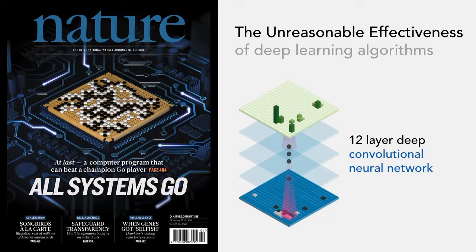In some sense, the reason why they could really beat humans is that instead of using brute force, as was done to beat humans at chess, in this case the whole image of the board is looked at and processed in a way that is very akin to a form of artificial intuition, if you want. So this is a very powerful concept. These deep convolutional neural networks have been shown to be incredibly powerful at analyzing images. And so we asked ourselves the question: can we use that to improve the quality of the images coming out of the microscopes?